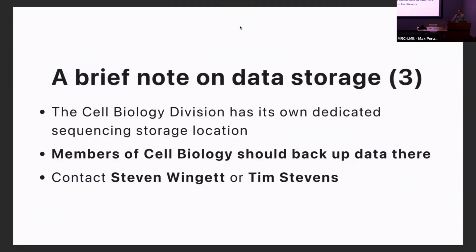Is anyone in cell biology here? Yeah. Okay, so we've just started our own dedicated storage space in cell biology. Tim and I are managing that. So if you provide us with your FASTQ files, it will be stored in-house. It's also backed up off-site at the Crook, and every 6 months we back it up to tape. So if you give it to us, it should be absolutely secure, barring something terrible. I mean, have your own copy as well, but we are rolling this out now. It's got its own GUI and front end, so you just give us a metadata. There's a form that takes 15 minutes to fill in, and then you and your PI will have access to the files that you deposit.